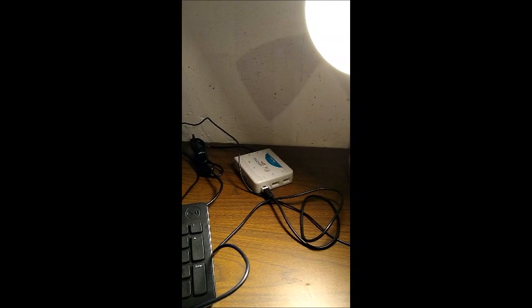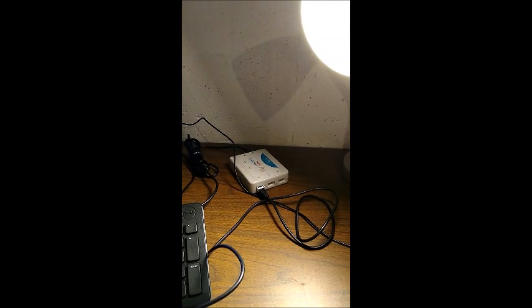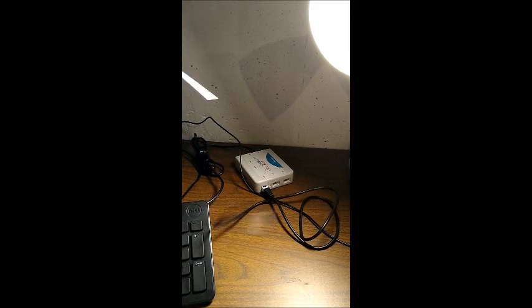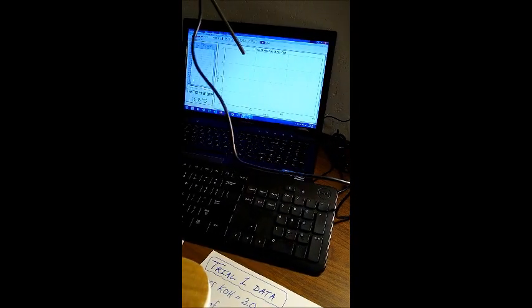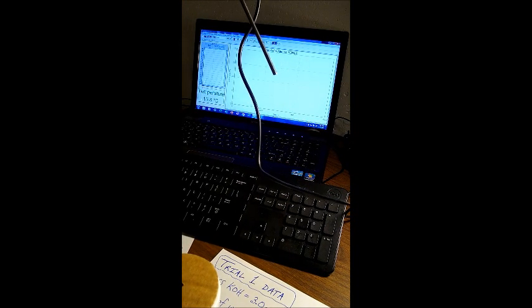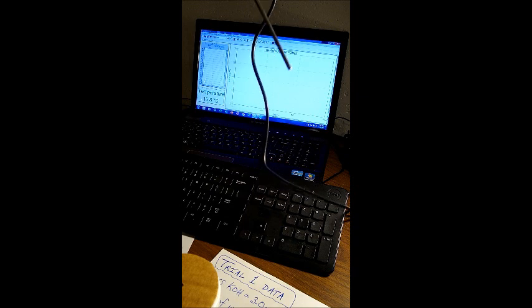We're using LoggerPro software, which is real nice to use for acquiring data. It's connected to this interface here, and it goes into my computer here, and I have the LoggerPro software opened up. It might be hard for you to see the screen from this vantage point, but I'll zoom in once I start acquiring the data.